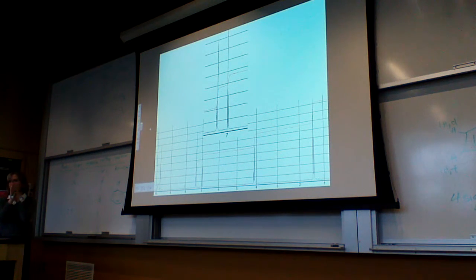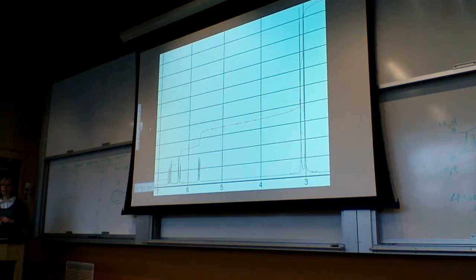That can be pretty common in the aromatic region because it's a small region, so you get peaks that are overlapping and you want to look as closely as you can to identify whether that's 1 signal or 2. In this case, we could tell because one side was way higher than the other of that doublet, and it integrated to 2. So check your integrations and look to see if it actually looks like a splitting pattern should. Sometimes you just have to call those multiplets.